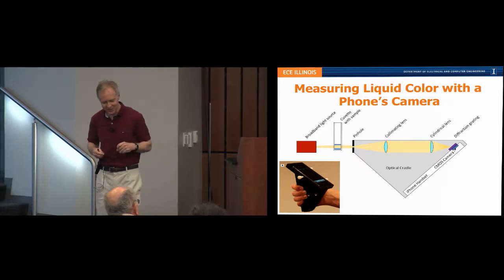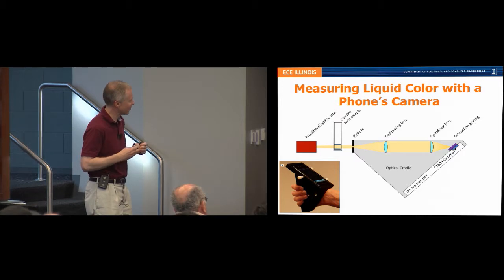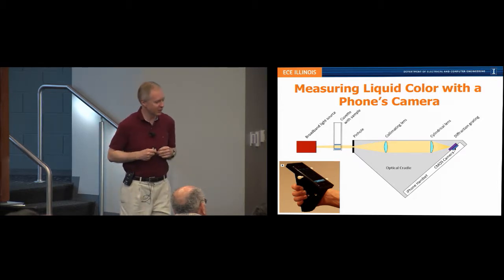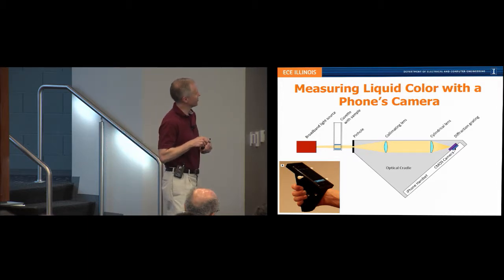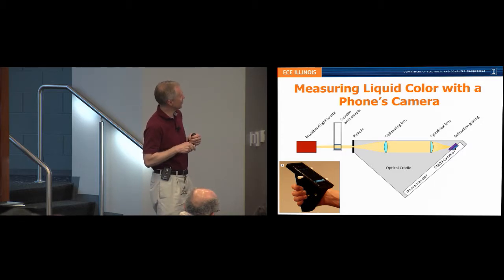So finally, I'd like to get to what this has to do with smartphones, and how we use this for doing all these sensing things. Well, we developed a system that allows you to take a white light source, such as from a light bulb or the white light LED in a camera, pass it through a substance, and measure the wavelength components that make it out the other side. The way we've done this is to make a small plastic, or in this case, our first one was made out of aluminum, cradle that interfaces with the back-facing camera in an iPhone 4.